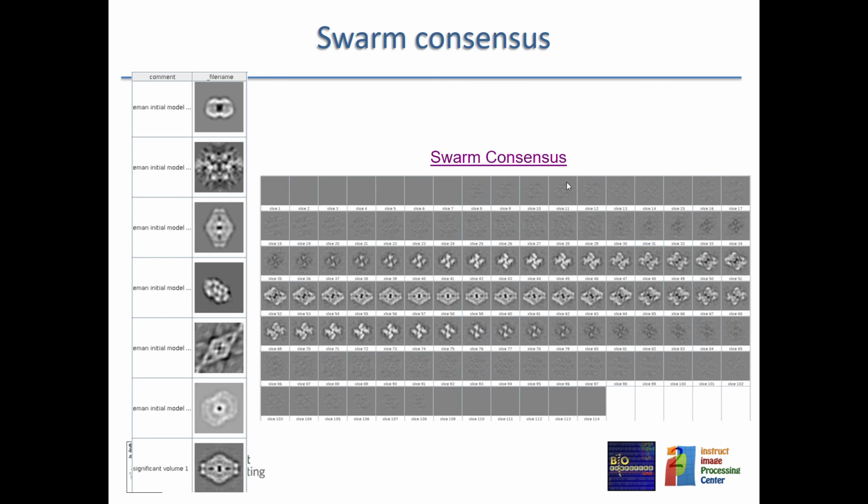So this is a local gradient optimization, a standard one. In our domain it would be just assigning angles according to the current solution, and then reconstructing the volume again.